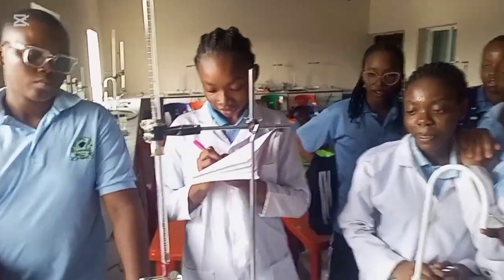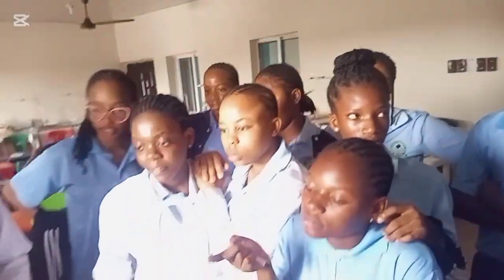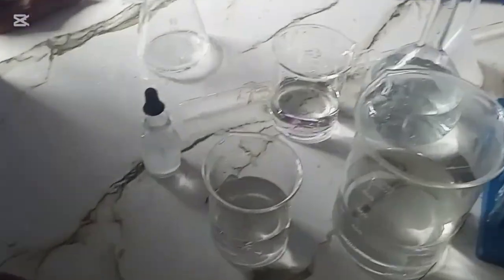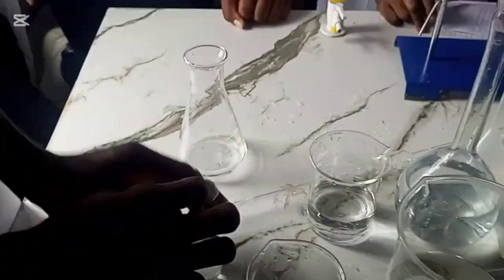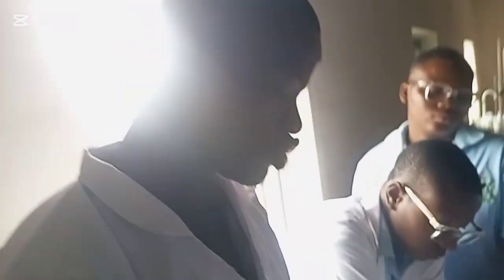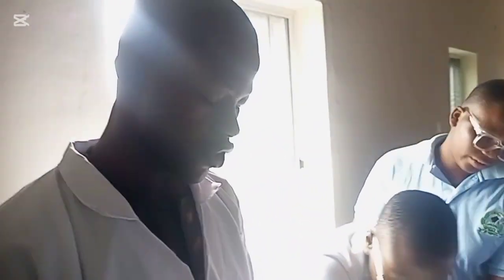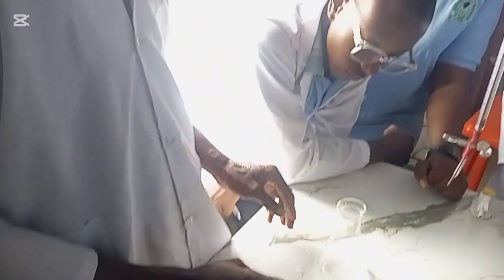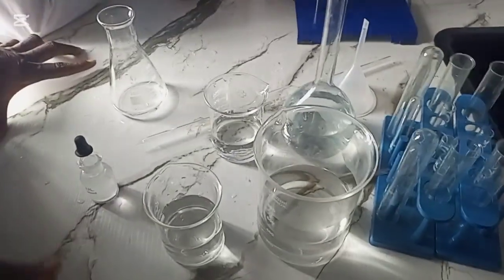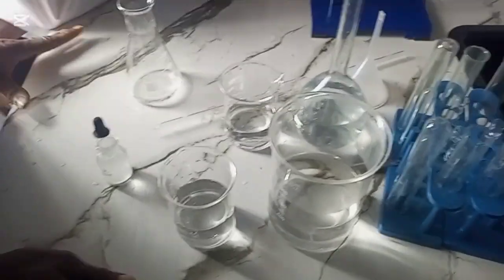It's okay. So we want to do the titration now. Before that, remember the work of the indicator. What did I tell us is the work of the indicator? It changes color according to changes in pH. There are types of indicator. We have methyl orange indicator, phenolphthalein indicator, methyl red, and many other types of indicator. But the popular ones are these three.